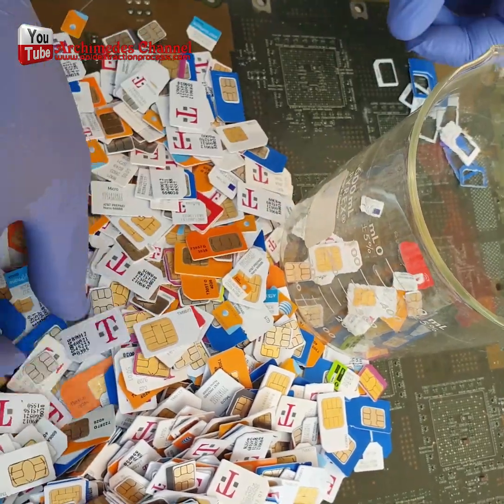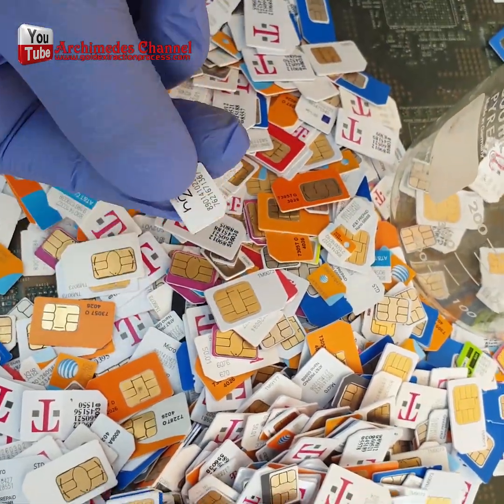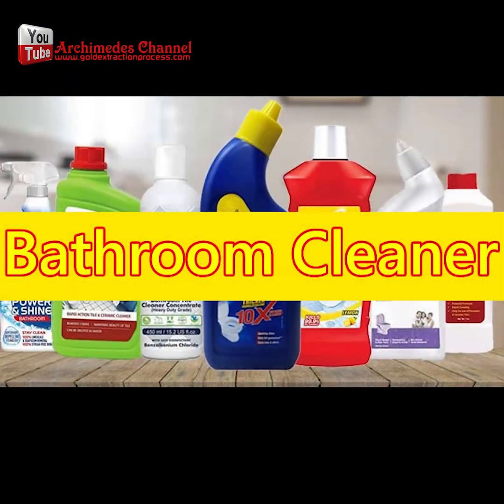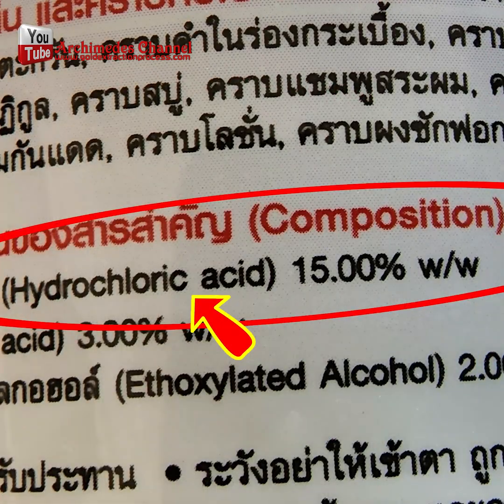First, collect as many of your SIM cards as possible and separate the plastic part from the SIM card. Use toilet bowl cleaner — must contain hydrochloric acid. If you have lab-grade hydrochloric acid, by all means use it. It can be found at Home Depot, most home improvement stores, and plumbing supply stores.